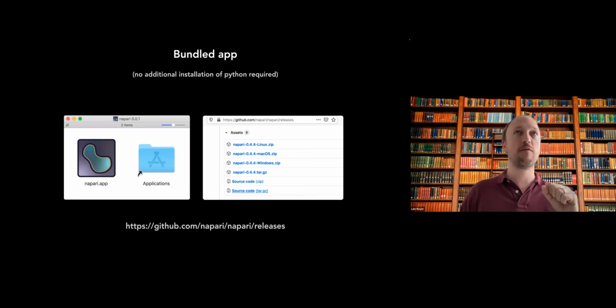Although I think some of the thing right now is that maybe the primary way to use it in Napari, and maybe the best one, is probably right now to actually use the pip installable in Napari. It's maybe easier for Python people that are familiar with Python to use Napari, but we really want to push forward eventually the use of an app. But that's going to take a little bit more time to get these things ironed out to the level where we can be confident that biologists, for example, or other scientists can really download Napari and have the full experience without any hiccups.